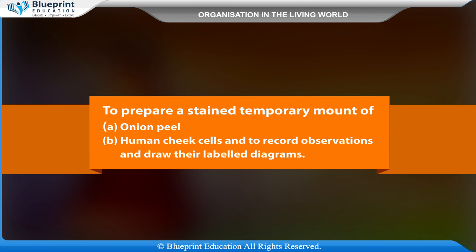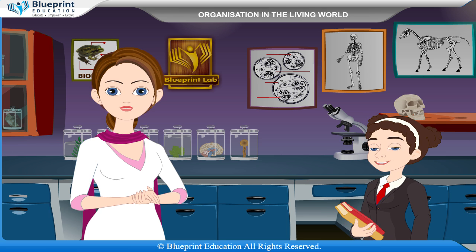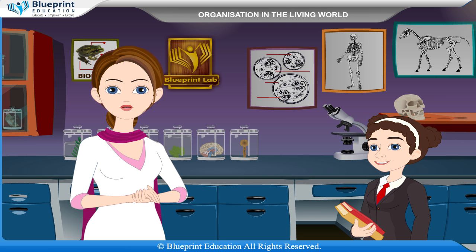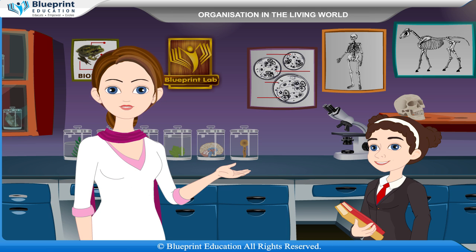To prepare a stained temporary mount of onion peel and human cheek cells, and to record observations and draw their labeled diagrams. The cell is a structural and functional unit of all living organisms.